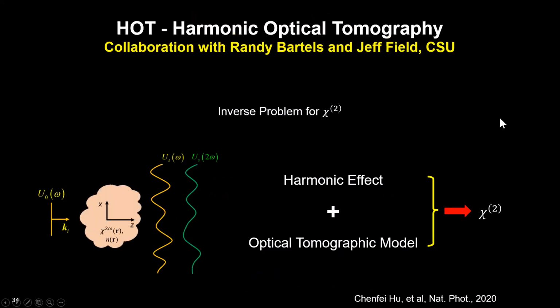Okay, I have some good news. Last week, we had this paper that just came out in Nature Photonics. This is a step further in the diffraction tomography field, I think. We extended the diffraction tomography to second harmonic generation. So you know, second harmonic generation microscopy has been an established method for looking at, especially, anisotropic structures such as collagen, for example. And it is a scattering method. It is a coherent method, meaning the phases are meaningful and they're preserved. So it's a coherent interaction between the light and the tissue.